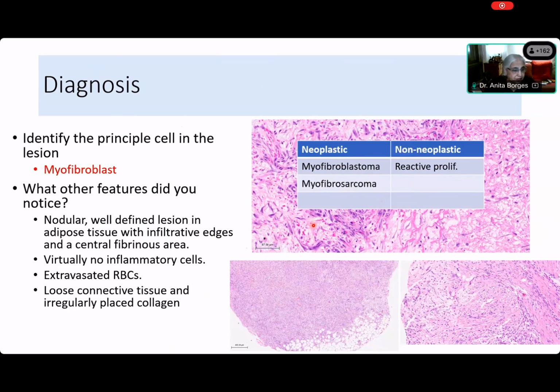Anybody else thought it was nodular fasciitis? Priyamada, what did you think? Priyamada, are you there? Maybe not. Aditi, are you there? Yes, ma'am. What did you think? Ma'am, I also thought of nodular fasciitis. Okay, so how did you make the diagnosis based on the features that you're seeing here? First of all, because of the history, ma'am, it is rapidly growing. Excellent, Priyamada. That is what makes this lesion a benign nodular fasciitis, because it had a short duration and rapid growth.